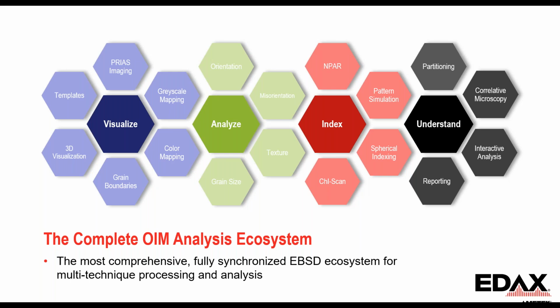And then in OIM analysis now, we have our re-indexing toolbox. This is where we can take the data that's collected on the microscope and process it further. We can find additional phases, we can index better, and that will include things like the pattern simulation and spherical indexing.